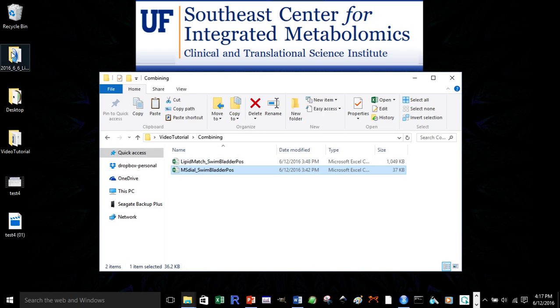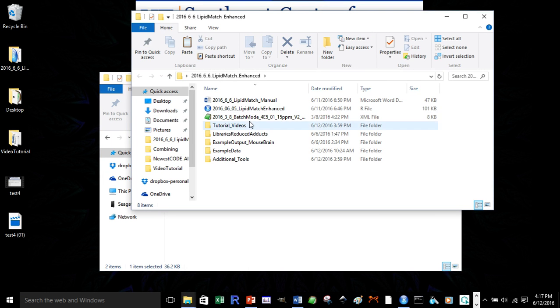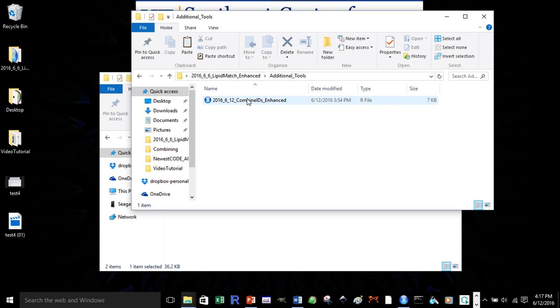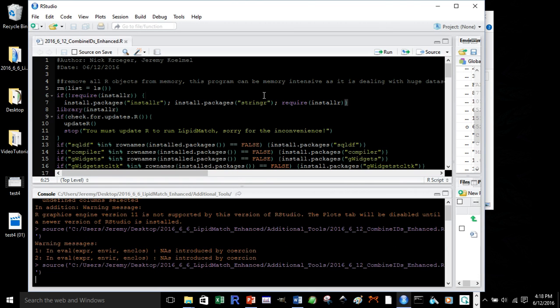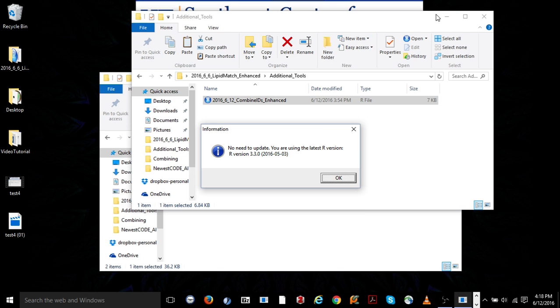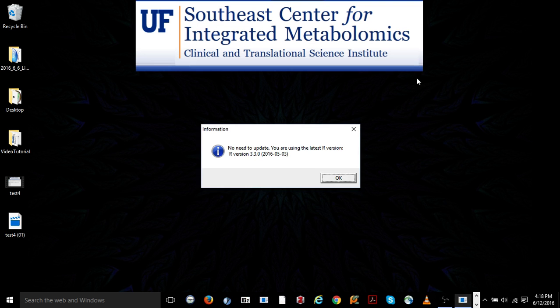Now, we'll go into our lipid match folder. In our lipid match folder, we'll open up the additional tools folder and our combined IDs enhanced code. Again, we'll just press Ctrl-Shift-S, and then you might have to minimize RStudio to see the pop-up boxes, but in this case, you didn't.